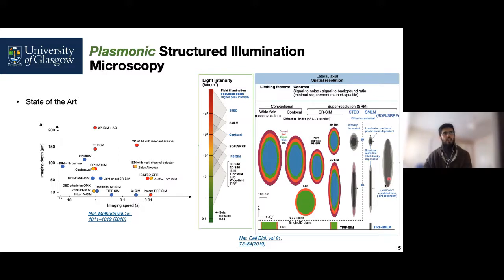Now the right side figure shows us the resolution capabilities that we have so far. And just to give you an idea, these structured illumination microscopy resolution techniques are being enhanced more and more with the advancement of different 2D materials as well as the development of sensitive sensors through which we can observe all this interplay between light and matter.